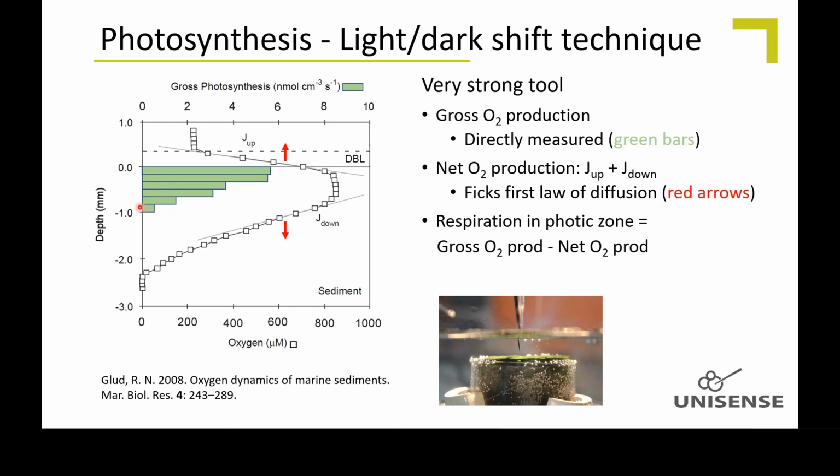So you stop measuring till you get no. Yeah, there has also been a measurement down here, yes, but there was no decrease in oxygen. Okay. No, that's right. Yeah, okay. And then it's a matter of keeping the units right, because you go from cubic centimeter to square meter, and you go from seconds to hours, and you go from nanomole to micromole. But that's okay.